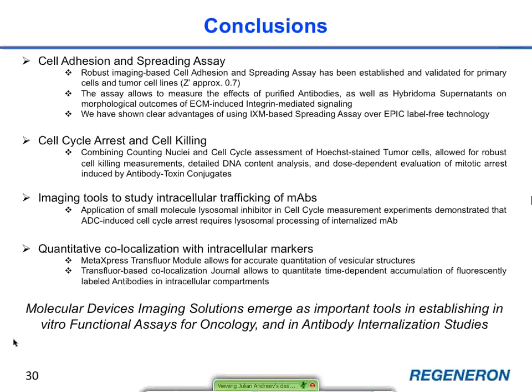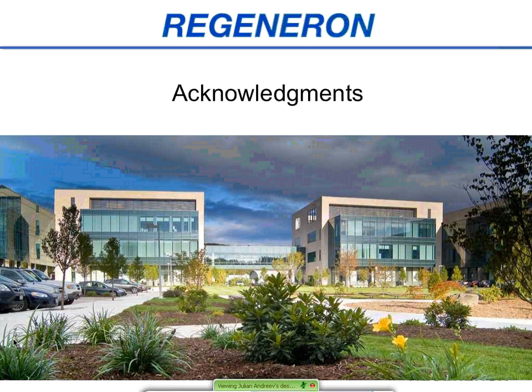Overall, I think Molecular Devices imaging solutions emerge as important tools in establishing in vitro functional assays in oncology, as well as the studies of antibody trafficking for ADC programs. Finally, I want to acknowledge my managers, VP of Oncology and Therapeutic Proteins, and my team who did most of the work. And thank you for listening.